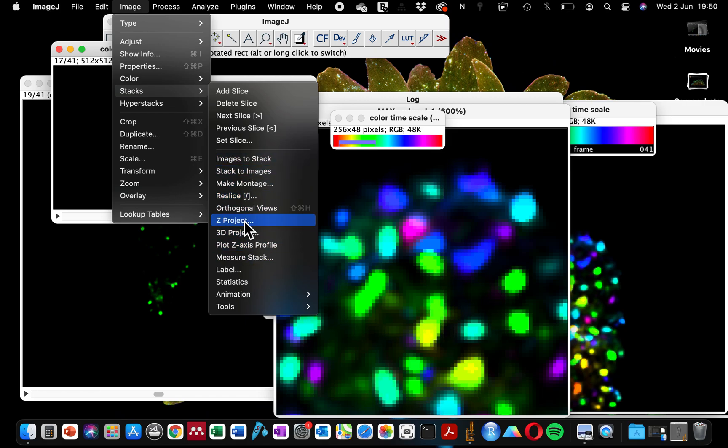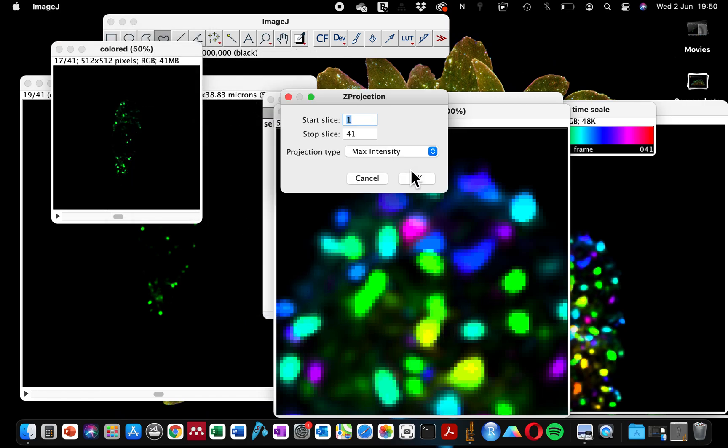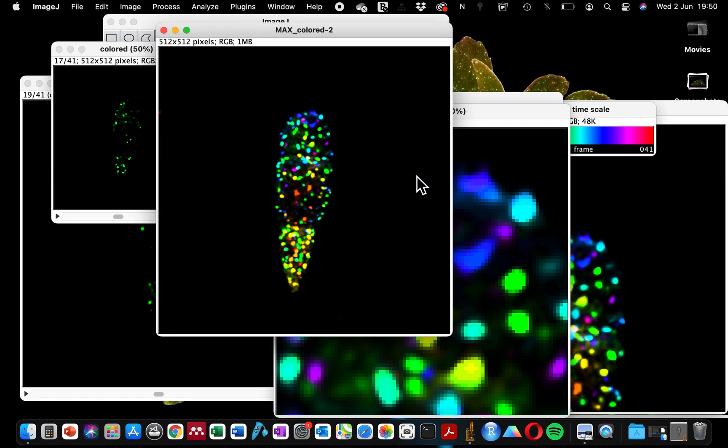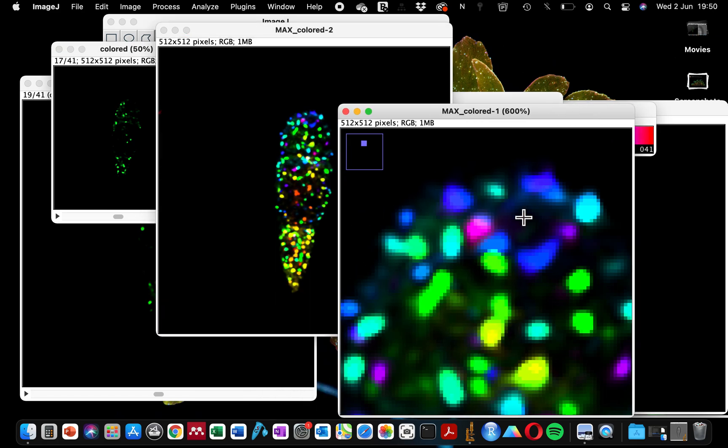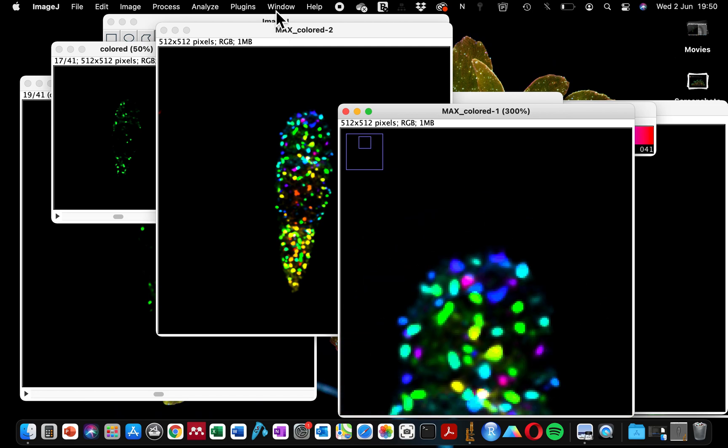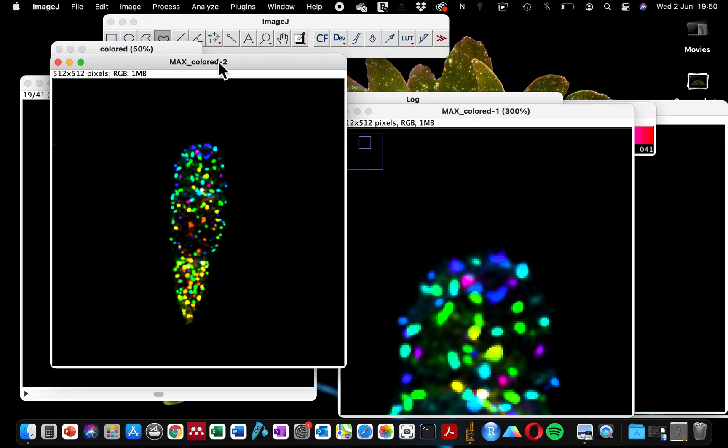You can see this also still ends up giving us this, just as an extra step further if you want to save the Z-stack and play it as a video. You can easily use the one that has the extra Z function.